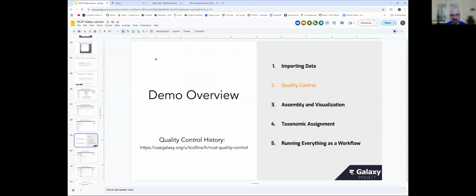And with that, those are the first steps in how you upload or pull in data, start to look at it, and a little bit of how the history works. Following that, even though I just had you import that history, I'll have you import another one. Now that we have our data in, one of the first things we want to do is some quality control, take a look at it, and do some light analysis.